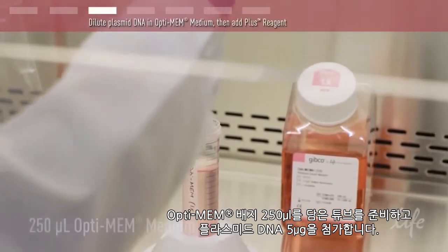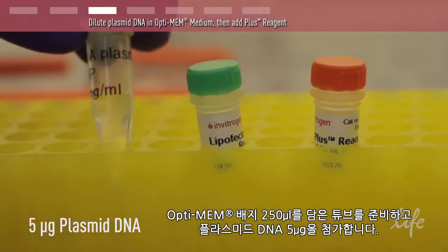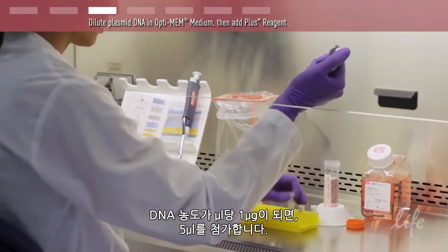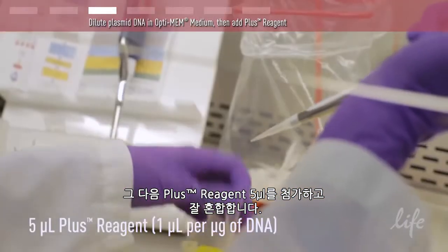Prepare a tube with 250 microliters of Optimem medium and add 5 micrograms of plasmid DNA. Since our DNA concentration is at 1 microgram per microliter, we are adding 5 microliters. Next, add 5 microliters of PLUS reagent and mix well.